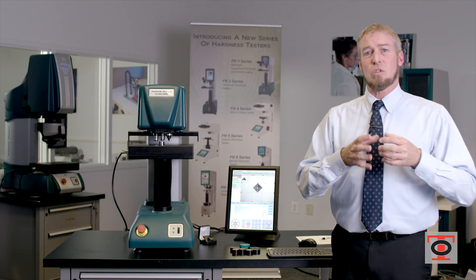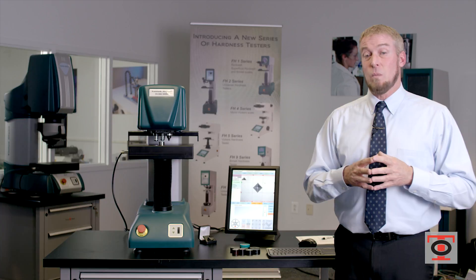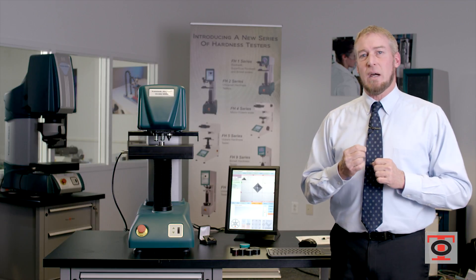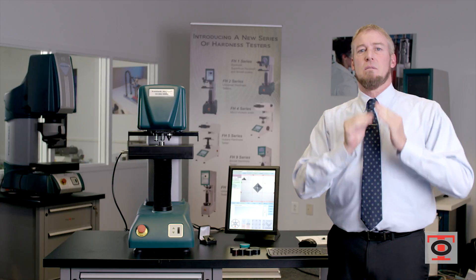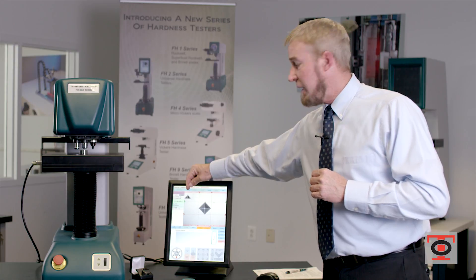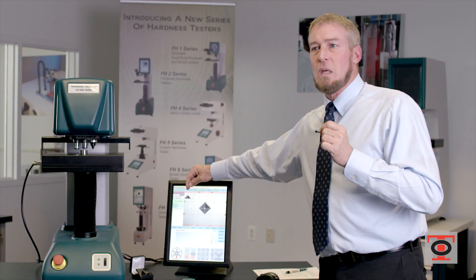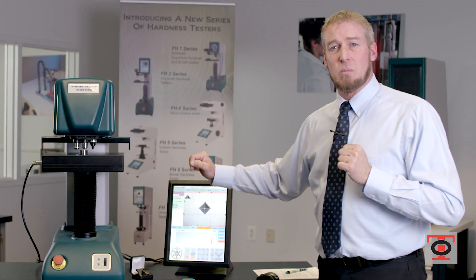So when you have operators who are subjective — everyone doing it differently — you tend to have results that will change as well. In our particular instance of measuring, we're not measuring from the filar lines you see on the screen. Those filar lines are to help you identify where a little red pinpoint is touching the very apex of the point of the indentation — that you will see up in the corner when you highlight each line. So now I have a little red dot that I can place exactly where I want. This is important for research labs. For someone in production, their plus or minus of the results may not warrant that type of adjustment, but know it's there.